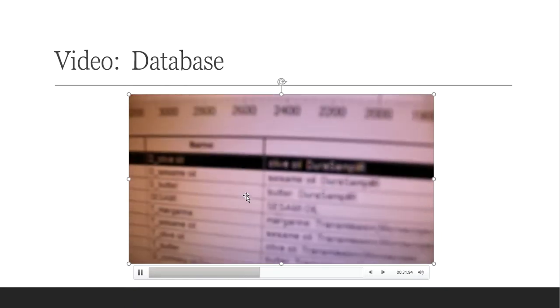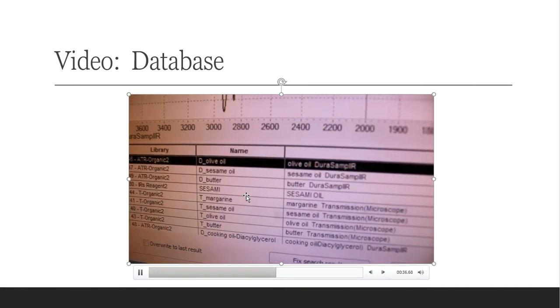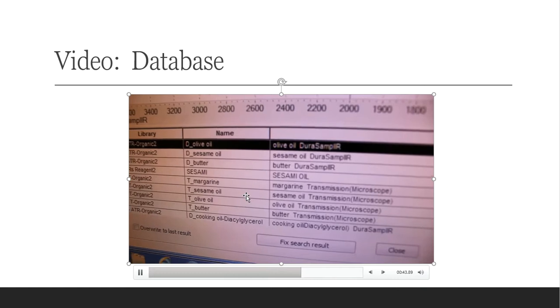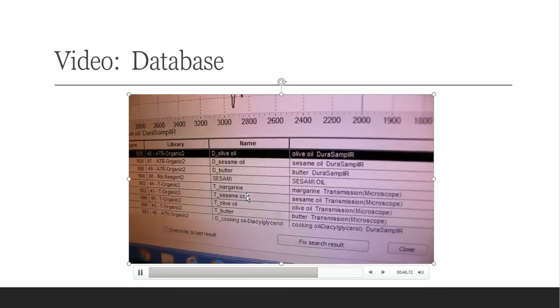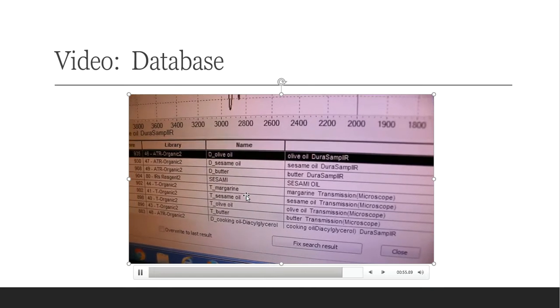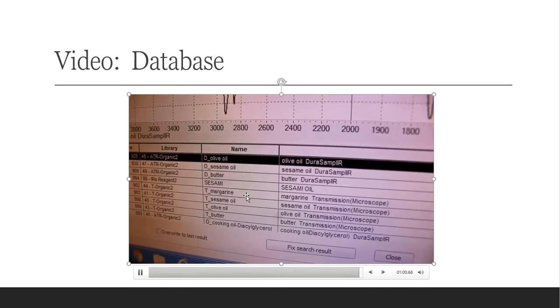And if I go in and take a look at the top choice, folks, let me give it some time to zoom in and focus. I see olive oil, but I also see sesame oil and butter and margarine and olive oil and butter and cooking oil. So all of these are very oily, and I'm very happy with this. It probably was not going to give me peanut oil, but olive oil is very close. So I'm going to run the pure peanut oil from Luana. I'm assuming it's pure peanut oil. And then we'll see what that gives us.